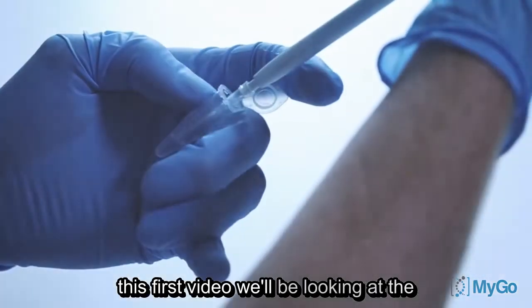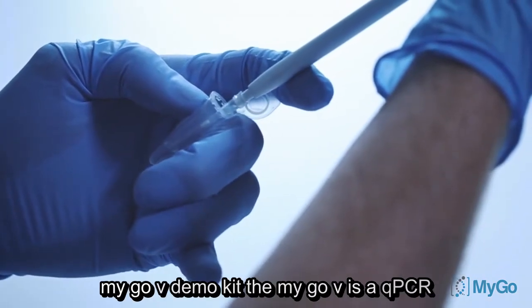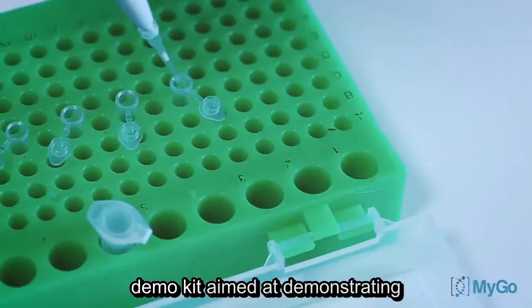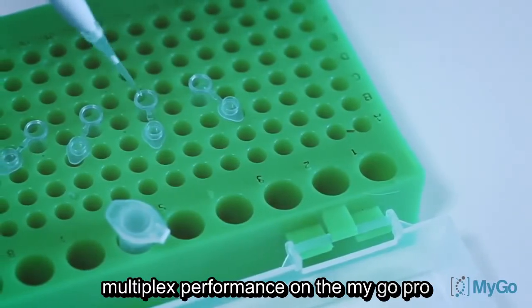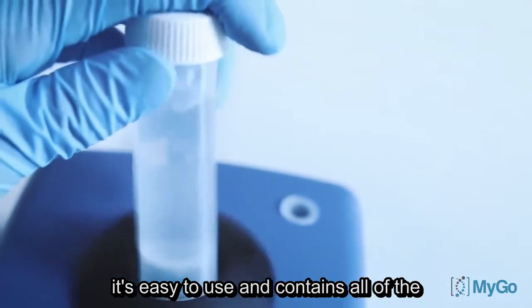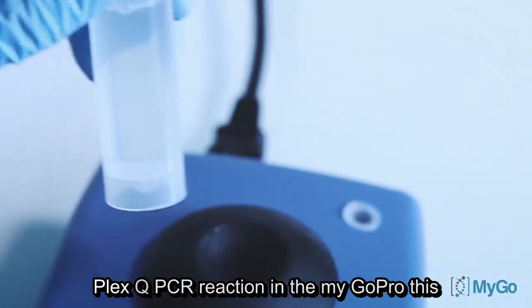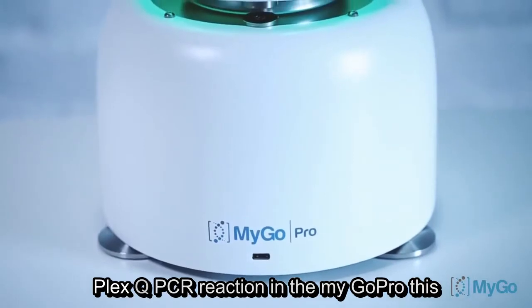In this first video we'll be looking at the MIGO5 demo kit. The MIGO5 is a QPCR demo kit aimed at demonstrating multiplex performance on the MIGO Pro. It's easy to use and contains all of the reagents you'll need to demonstrate a 5-plex QPCR reaction in the MIGO Pro.